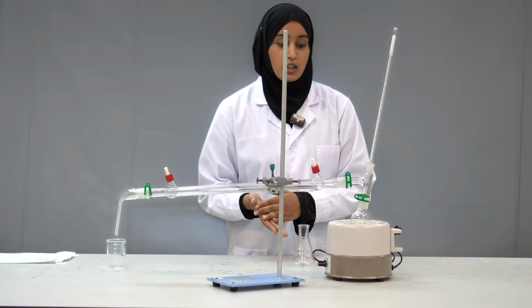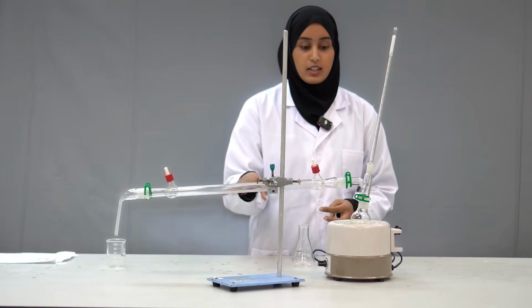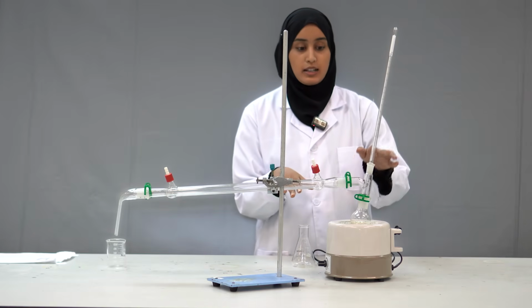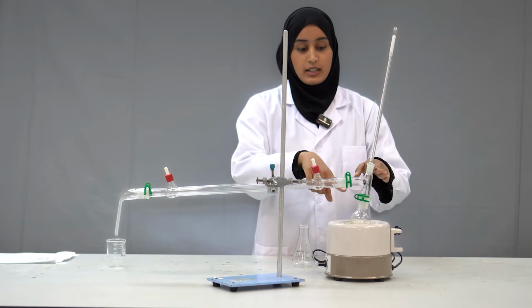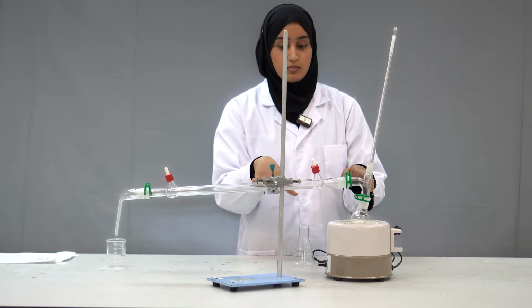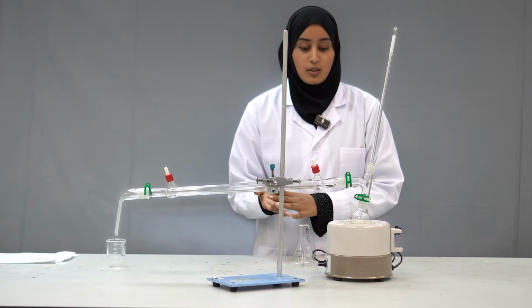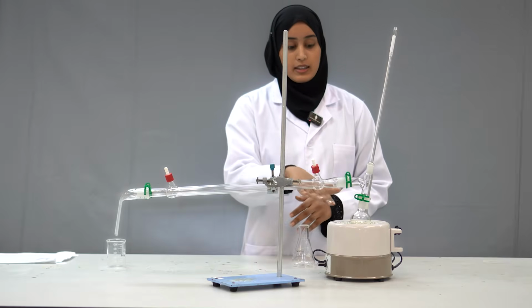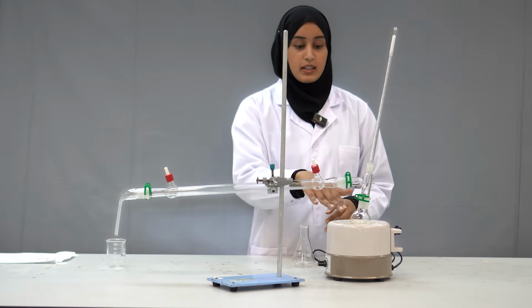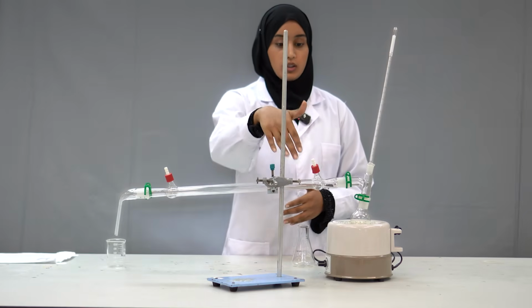And this thermometer also has another purpose, which is to act as a stopper, so that the liquid which is getting vaporized will not go into the air.